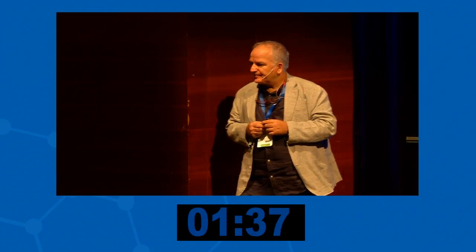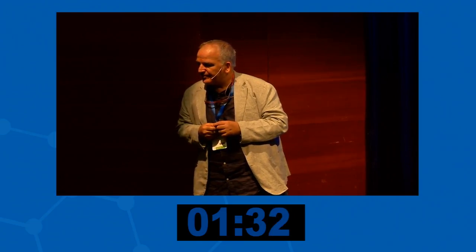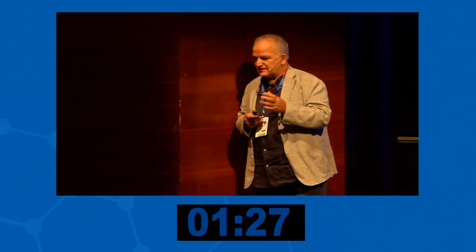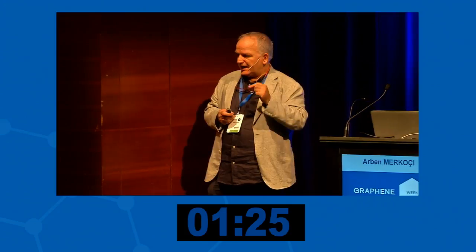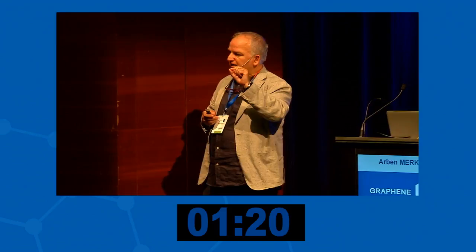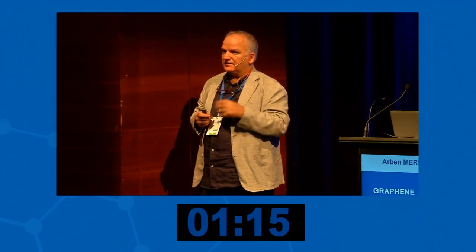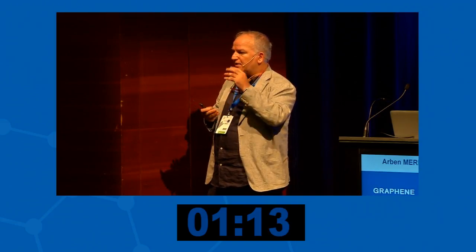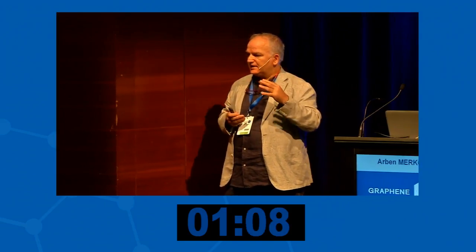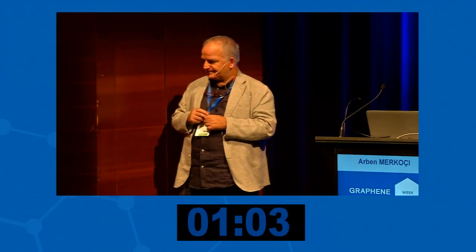So I was wondering how effective this quenching is, and then you show that by adding the GO, you completely quench the spot. Yeah, so this works really very nicely. The graphene oxide is quenching, and the efficiency of this quenching depends, of course, on the quantity of the analyte you are using. So whether you have more or less analyte, the quenching will be different, and we are able to quantify this change. Okay, thank you.